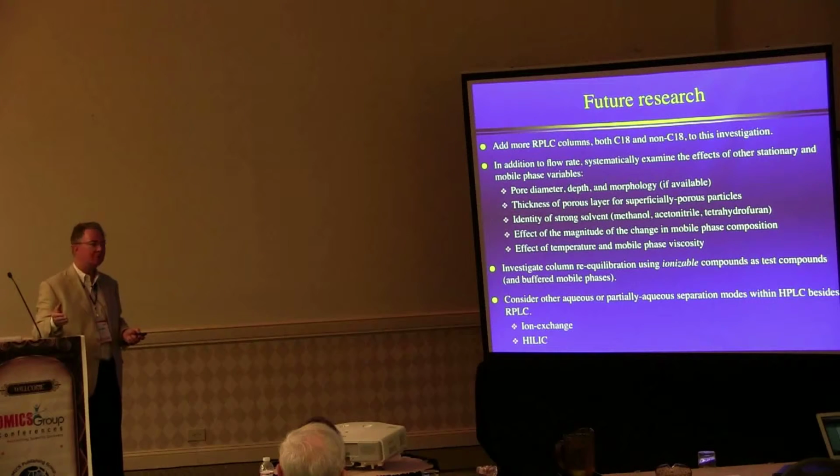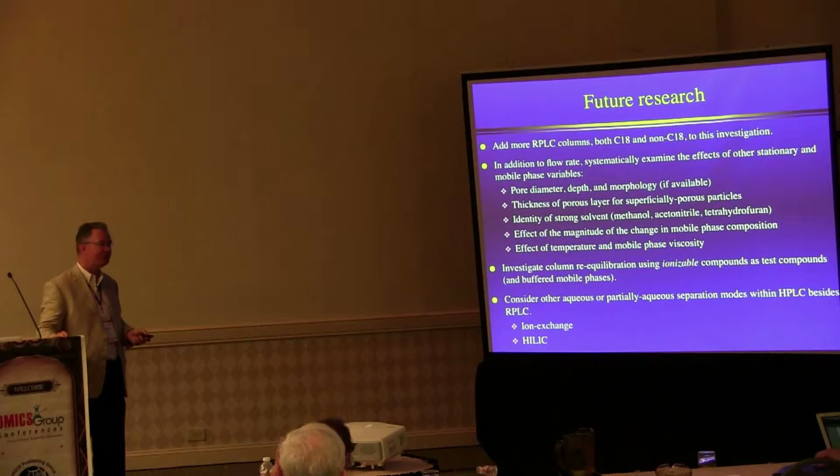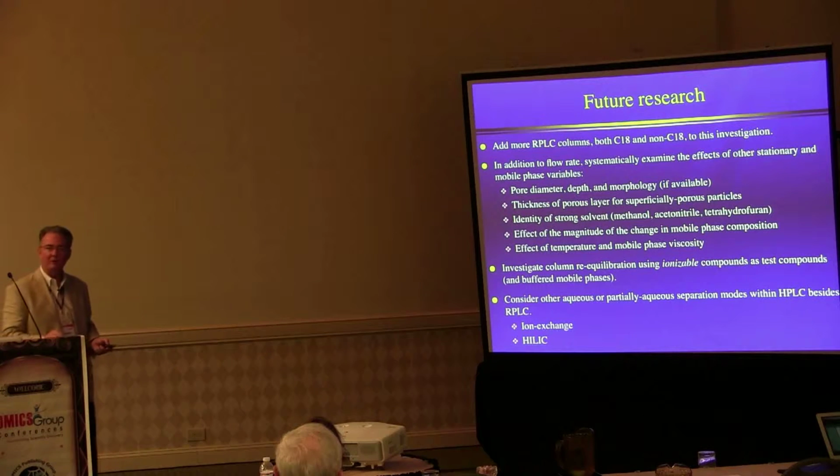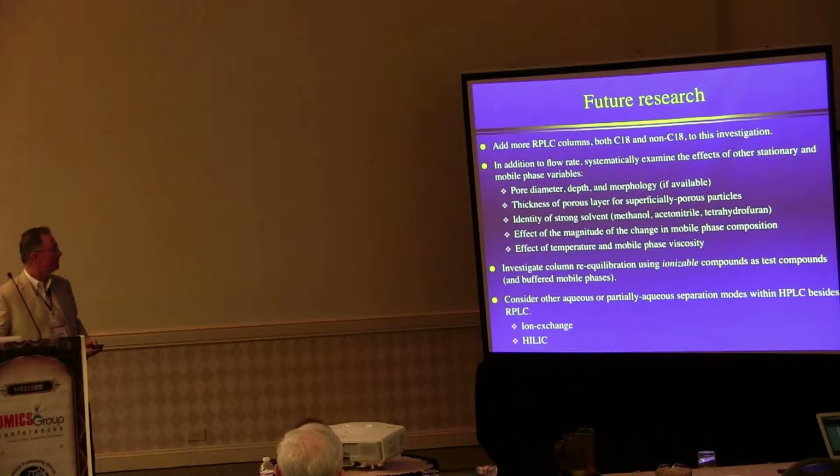And we had been using, in this particular study, the retention time of acetophenone, which is a neutral compound, as our test compound to measure re-equilibration, but we want to consider ionizable compounds in the future. We also want to look at aqueous or partially aqueous separation modes other than reverse phase liquid chromatography. Those would include ion exchange and, if you're familiar with it, HILIC.